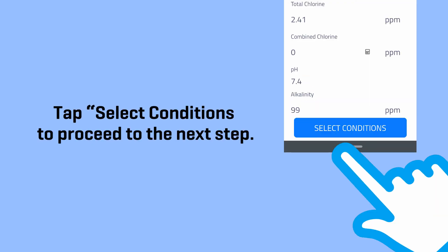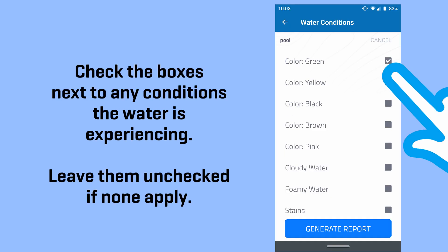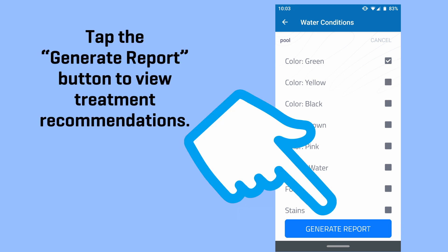Tap Select Conditions to proceed to the next step. Check the boxes next to any conditions the water is experiencing, and leave them unchecked if none apply. Tap the Generate Report button to view treatment recommendations.